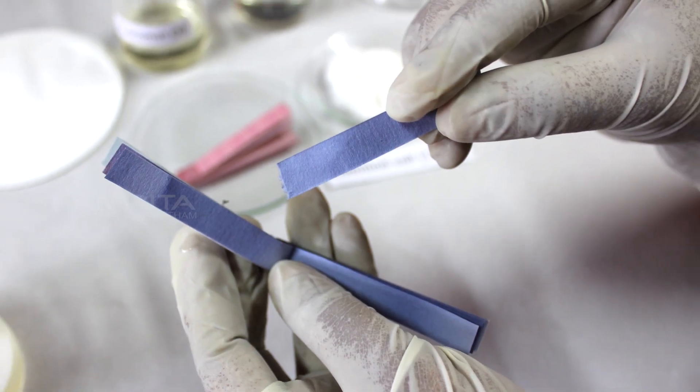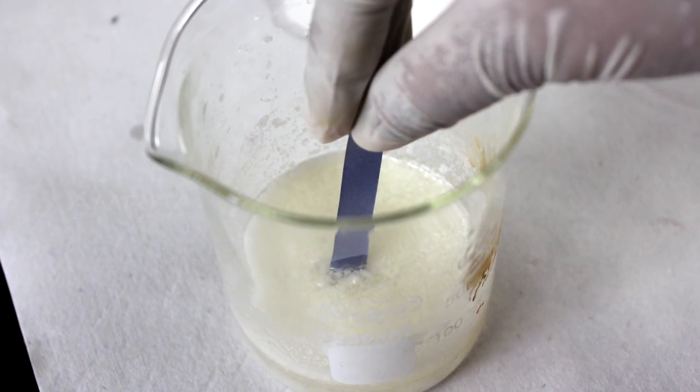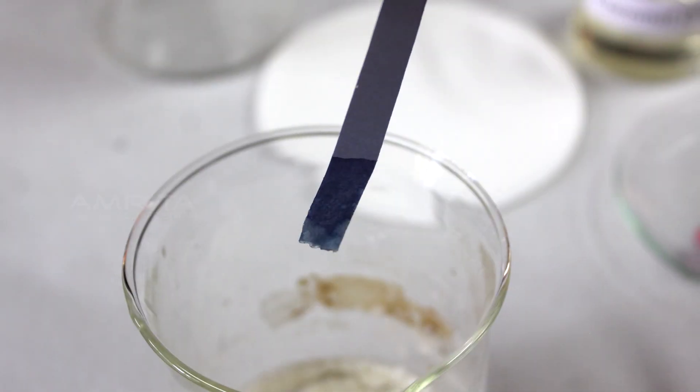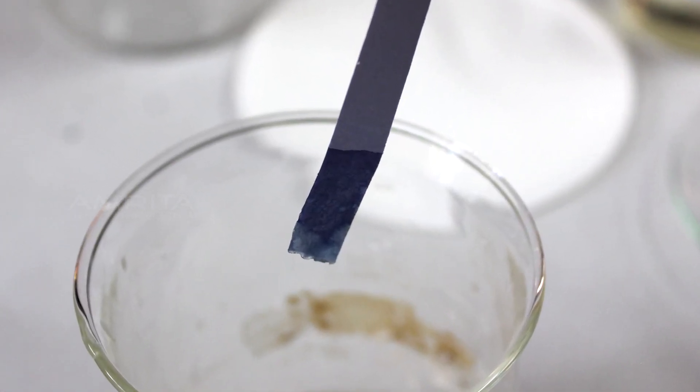Now take a blue litmus paper and dip it in the suspension. The colour of blue litmus paper remains the same indicating that soap suspension is not acidic in nature.